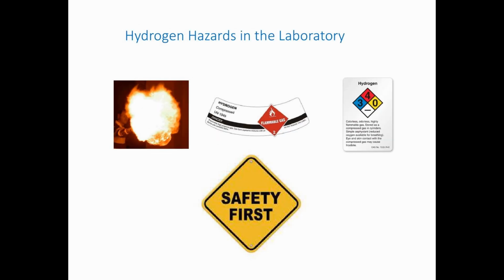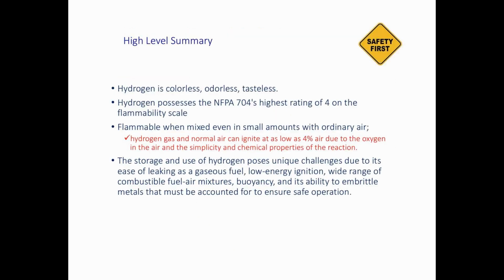Hydrogen hazard is an important topic that we need to talk about in the laboratory. So, a high-level summary for the safety. Hydrogen is colorless, odorless, tasteless. It's flammable when mixed, even a small amount, with ordinary air. So hydrogen gas and normal air can ignite as low as 4%, which is known as LEL, due to the oxygen in the air and the simplicity and chemical property of the reaction.